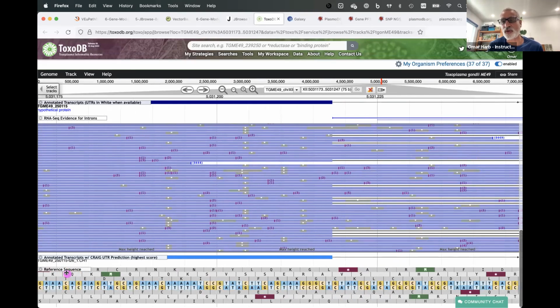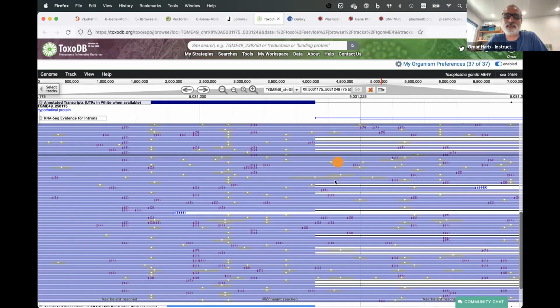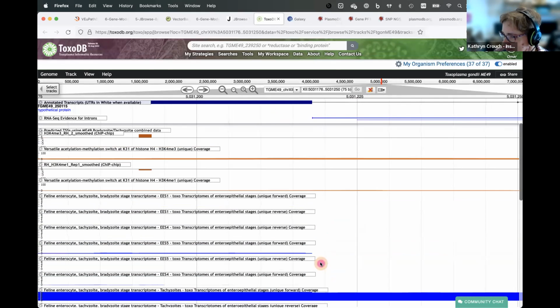The cool thing about this, obviously, is that it's important to understand where the data is coming from, what the pitfalls of the technology are, and also knowing that you can access the sequence of the data and take a look at it this way. So that's probably exactly what's happening here, Catherine, as you described. It's pretty cool. Good to know.